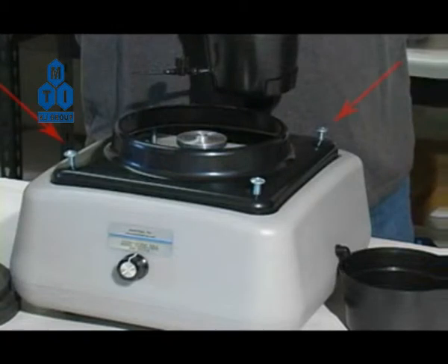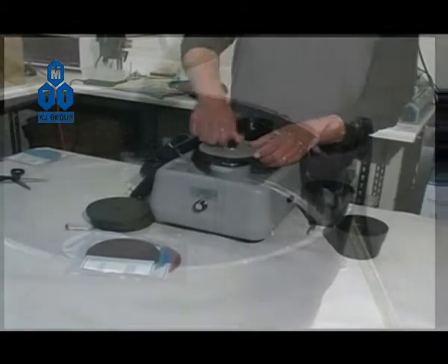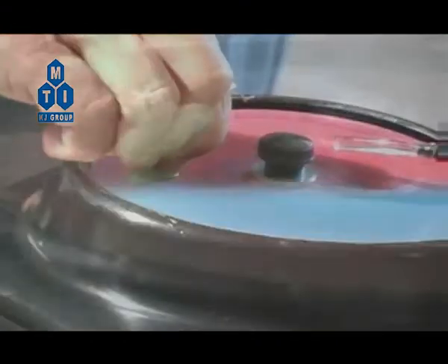If necessary, adjust the height of the water guard using the four screws. Check the coolant receptacle often so it doesn't overflow and make a mess. Be sure to clean your machine thoroughly with a damp towel after each use, and empty and dry out the reservoirs below the water guard.